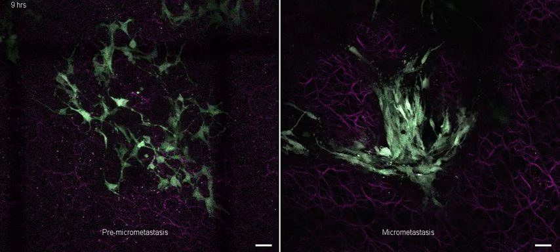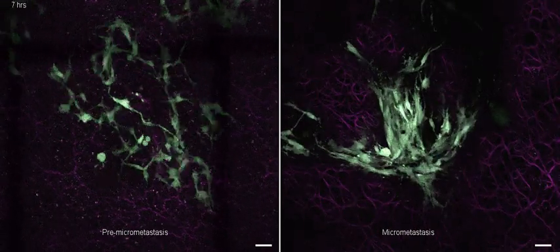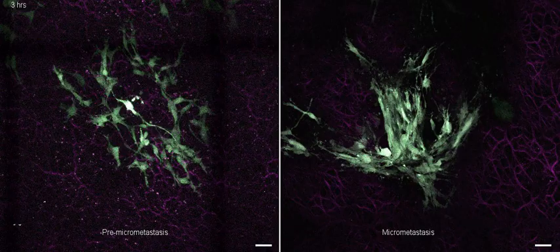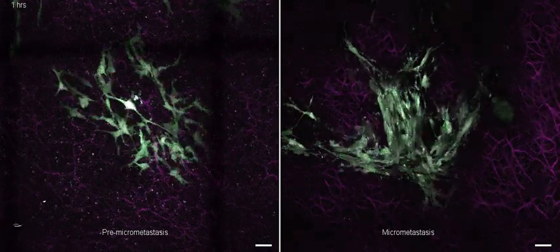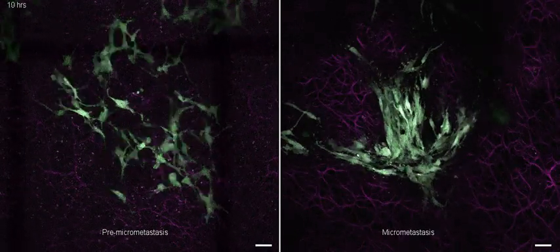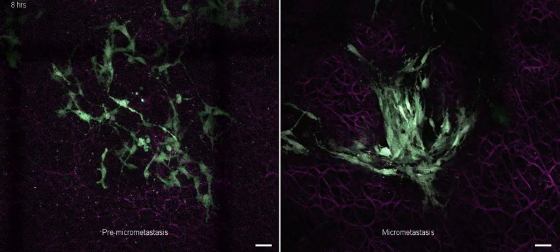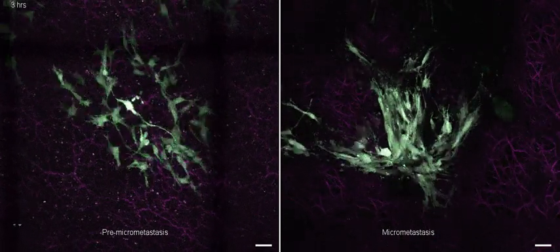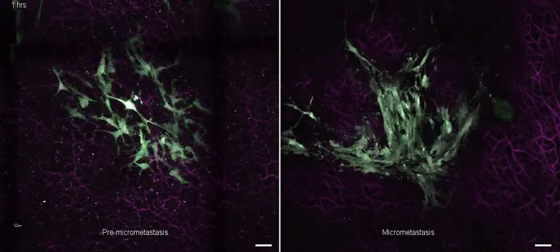On the left-hand side, you see a pre-micrometastasis. On the right-hand side, you see a micrometastasis. We injected fluorescent colorectal tumor cells. They arrive in the liver, and on the left-hand side, you see a three-day-old pre-micrometastasis. On the right-hand side, a five- to six-day-old micrometastasis.